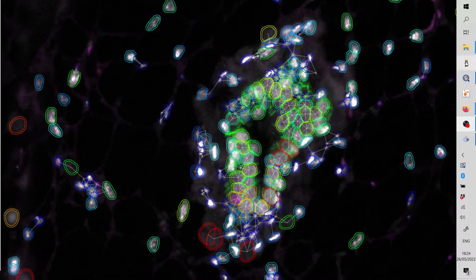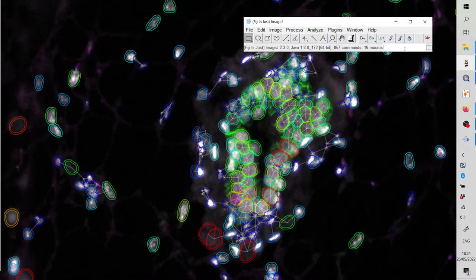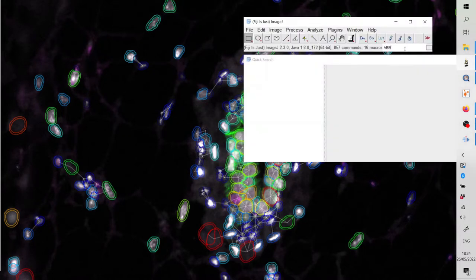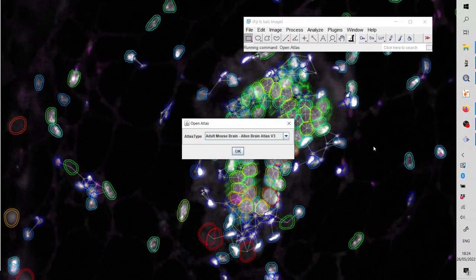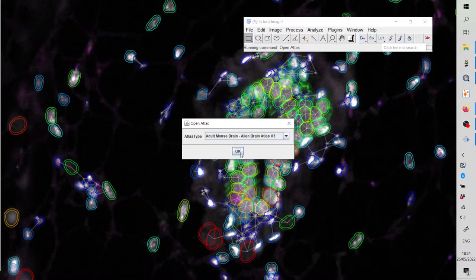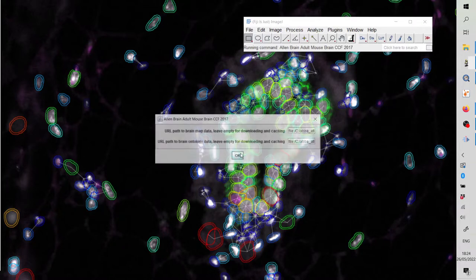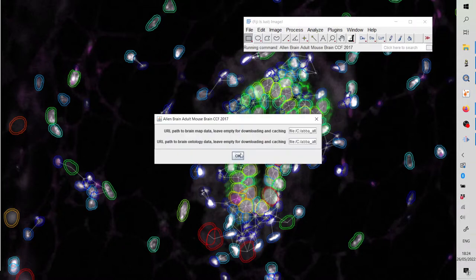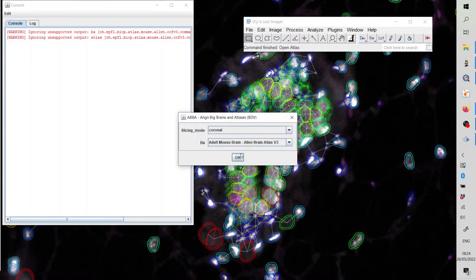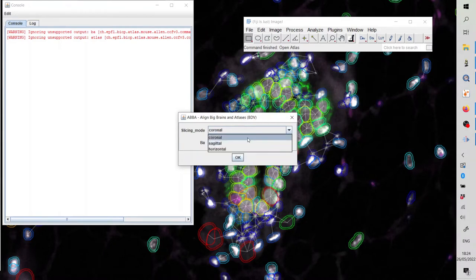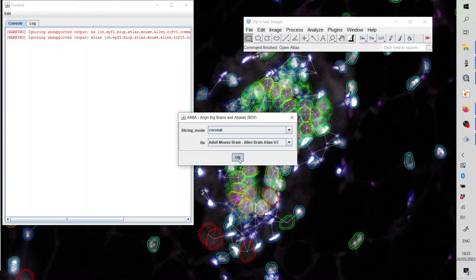I am now done with the dataset definition. I can minimize QPath and move on with the following part of the workflow. Let's start Fiji. I type ABBA in the search bar, find ABBA start and click Run. The demo dataset consists of mouse coronal sections, so I choose this atlas. The sections are coronal, so I click coronal in slicing mode and click OK.